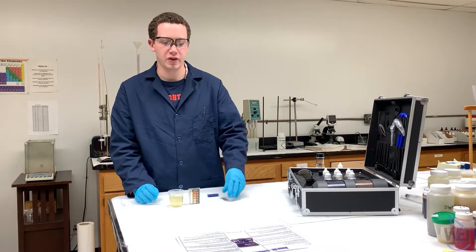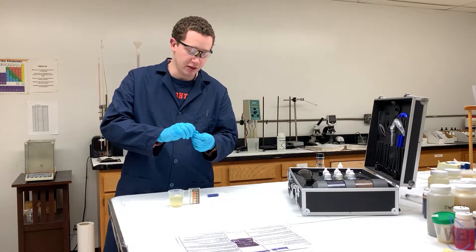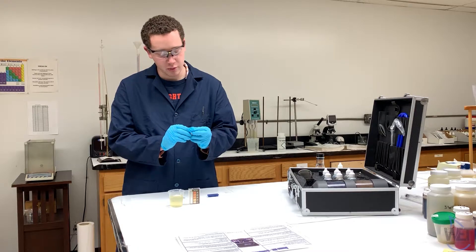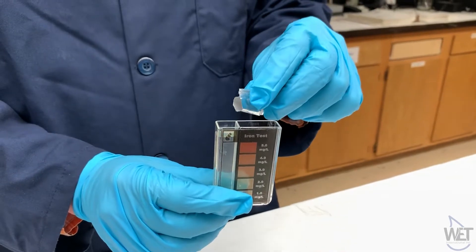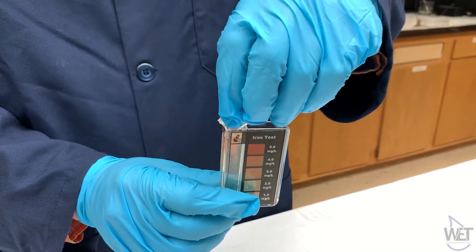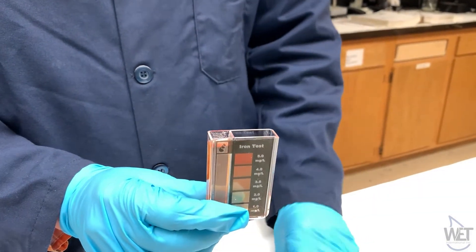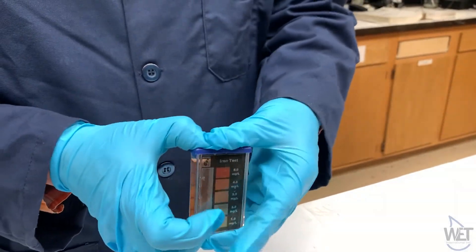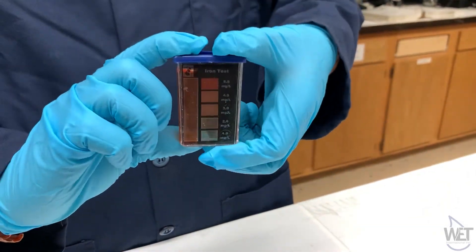Then you are going to take one iron reagent powder pillow and add the contents of it directly into the comparator. It should turn red in the presence of iron. Then let that react for five minutes.